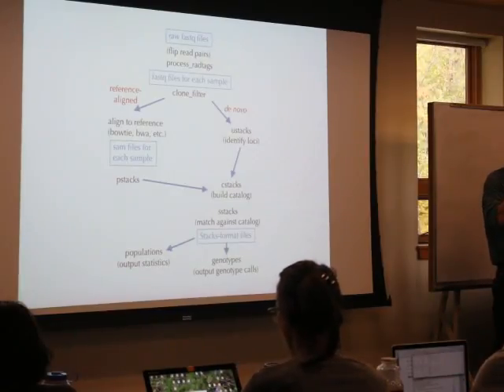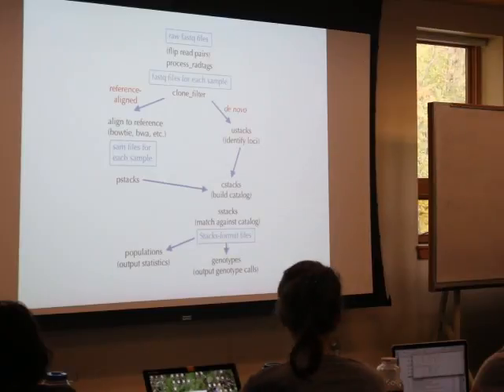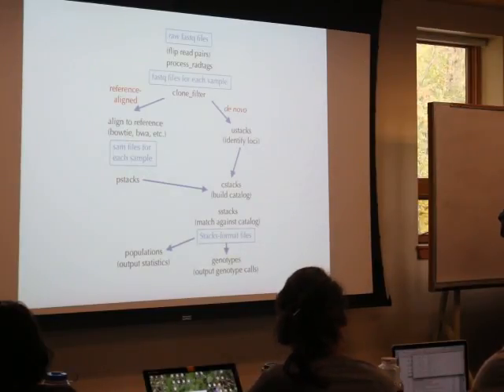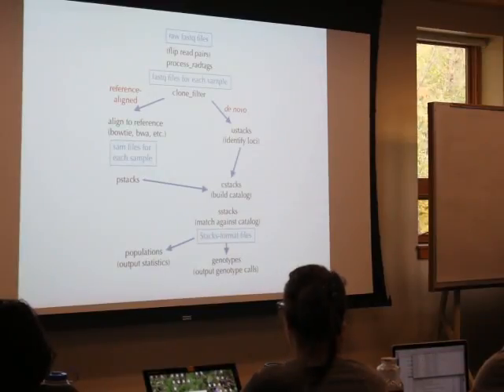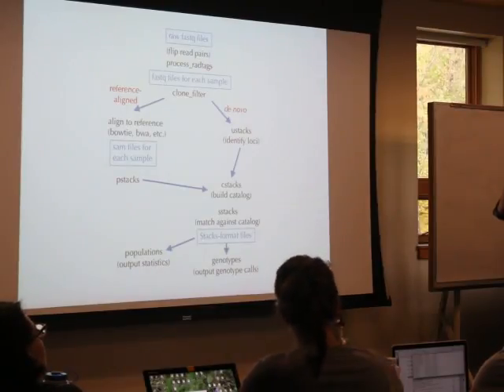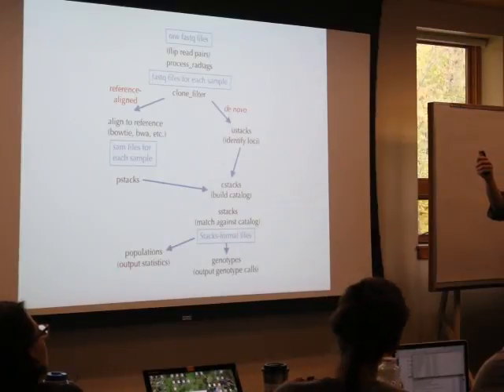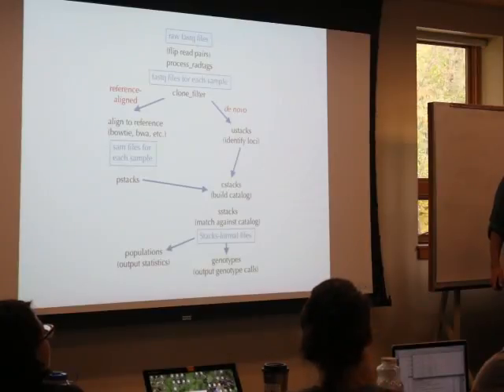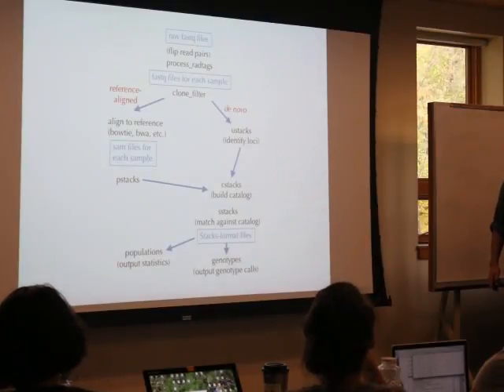Actually, I was just talking to Gordon this morning. We were talking about rates of PCR duplicates. In my lab, we found rates of PCR duplicates anywhere from 5% to 50% or so. Again, there are lots of things that can affect it, like primarily starting amount and quality of DNA, the number of samples that you're multiplexing. So the better the DNA you start out with, the more samples you multiplex into one library, the lower your rate of PCR duplicates will be.